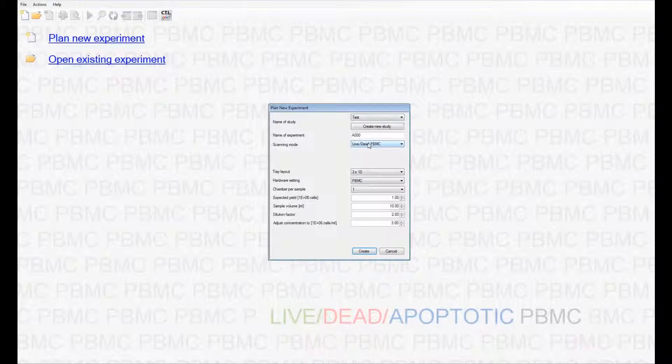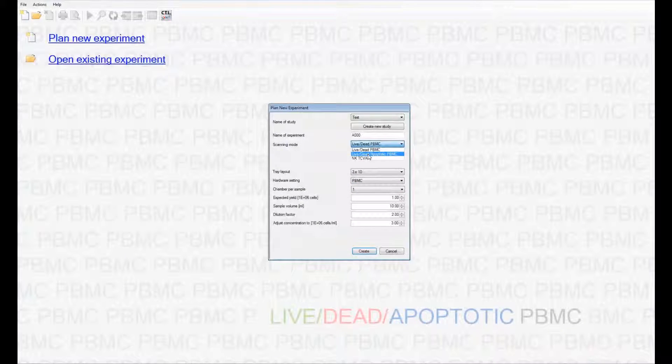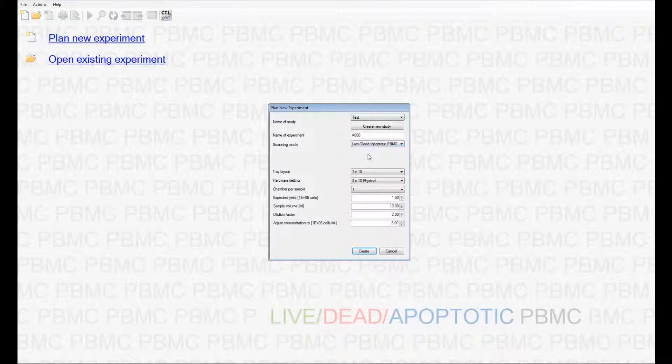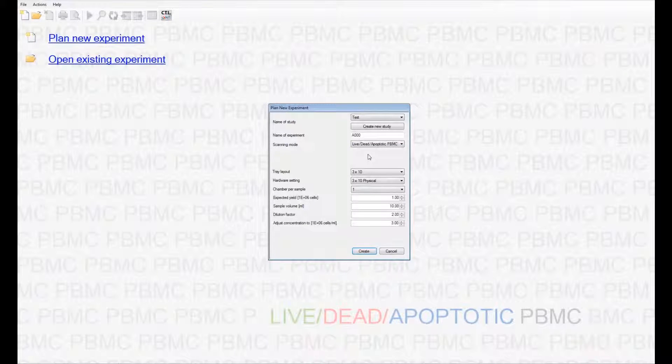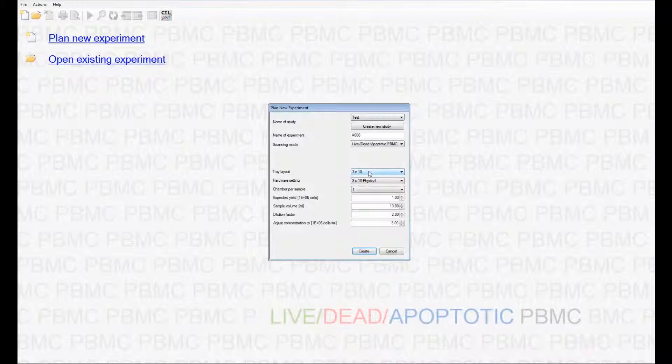At this time, we are going to see a demonstration of the live dead apoptotic numbers for a PBMC sample using a 3x10 hemocytometer.